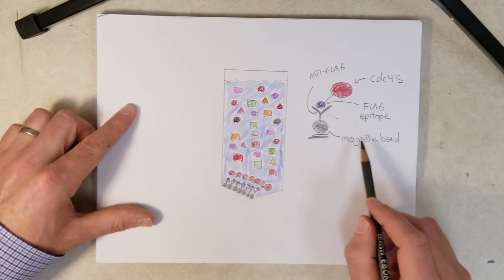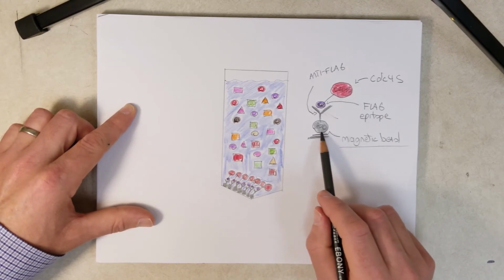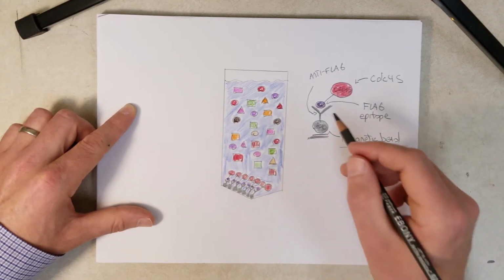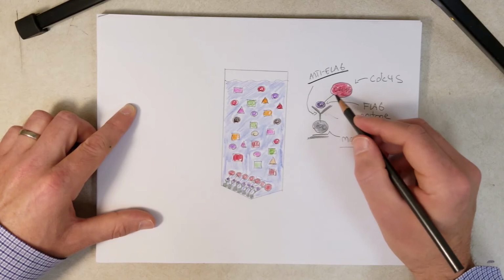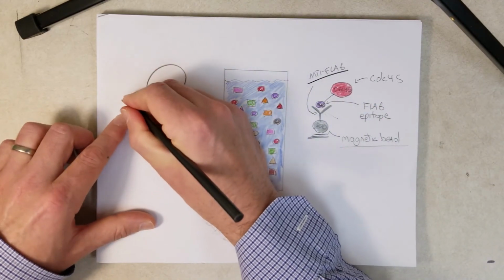In this case, this magnetic bead is microscopic, it's tiny, right? You can't see it without a microscope. It's conjugated to an antibody. In this case, the antibody is the anti-flag antibody, so it recognizes the flag epitope. And then here's our fusion protein right here. Maybe you can't see the words, but essentially our fusion protein looks like this.